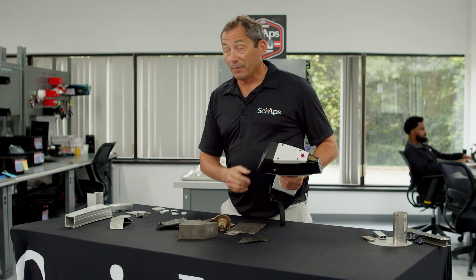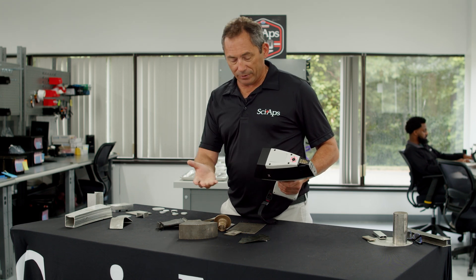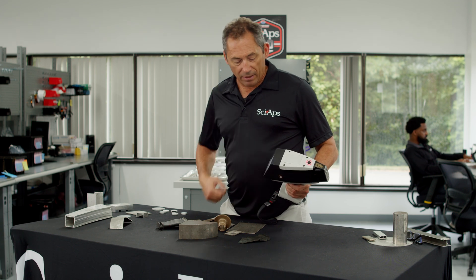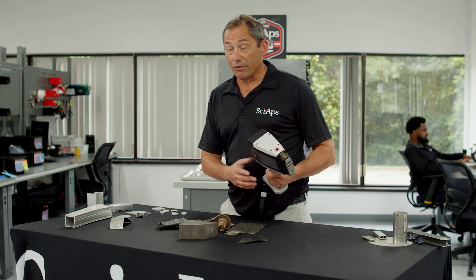First of all, you'll see it's really easy to turn on and fire up. Once you turn it on, it comes up to its temperature, you hit analyze, you do a wavelength calibration — that's all it takes right there, and now you're good to go.